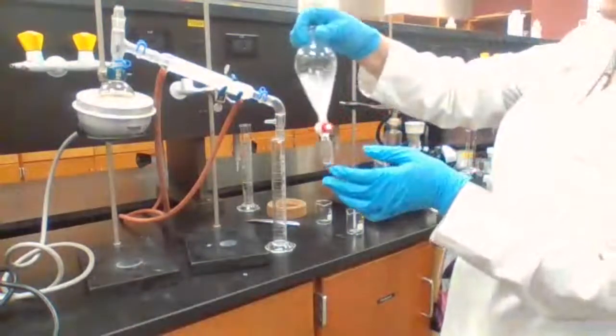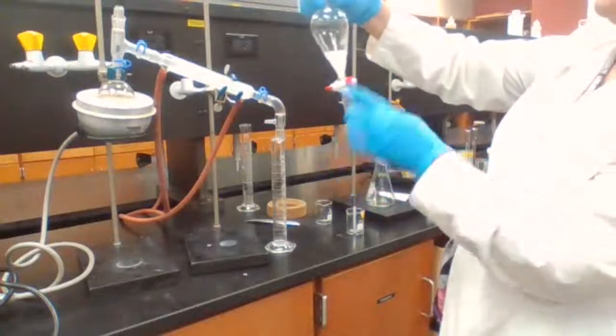Super cloudy. Hopefully we can separate it without.